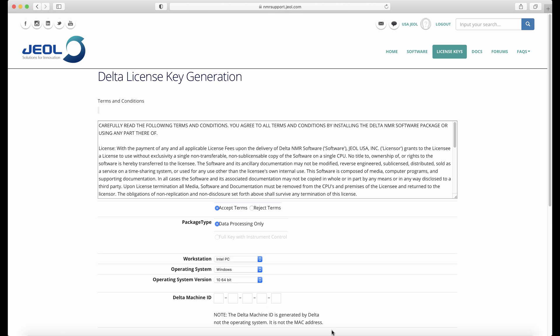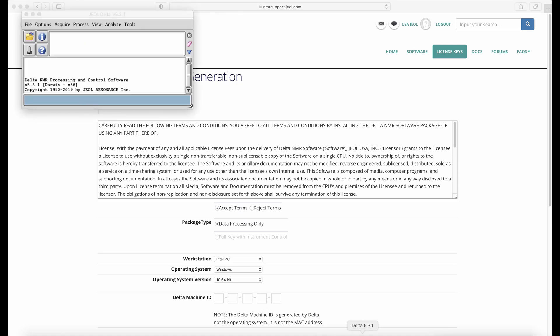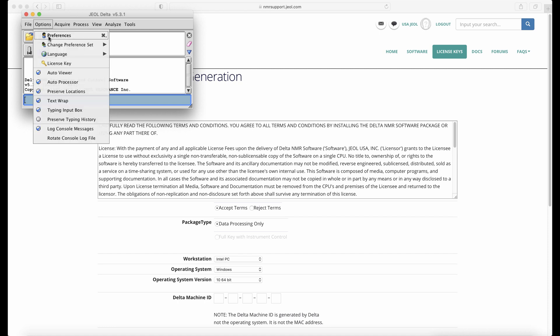In order to do this, open up Delta, go to the options menu, and choose license key.